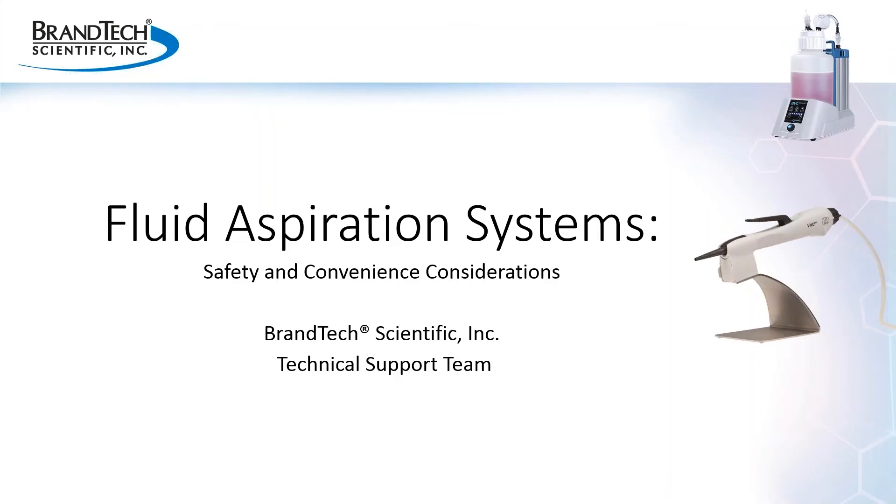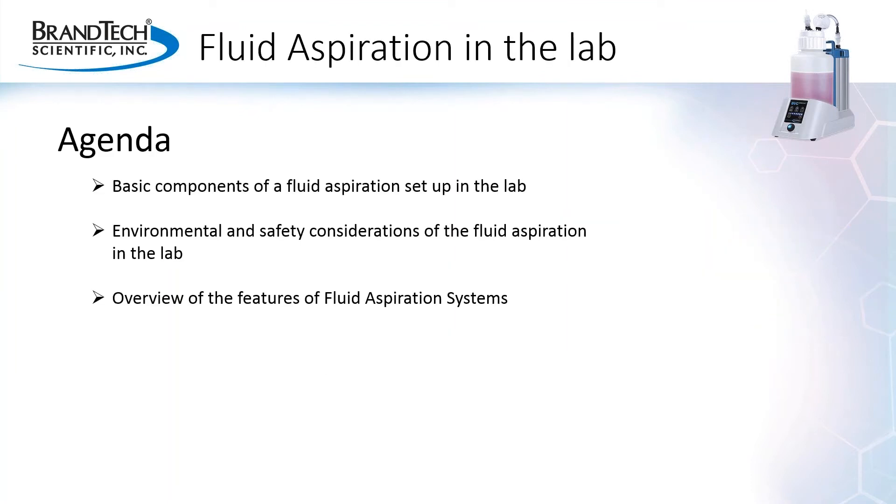Welcome to today's webinar, Fluid Aspiration Systems: Safety and Convenience Considerations, presented by BrandTech Scientific. In today's discussion, we'll review the basic components required for fluid aspiration setup in the lab, the environmental and safety considerations, and provide an overview of the features available with fluid aspiration systems.